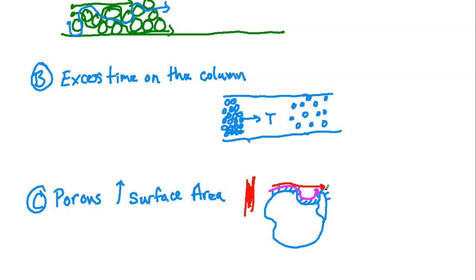Okay, and so this is the general concept of mass transfer, as we're jumping particle to particle, or we're literally taking the mass, the analytes, and moving them along the column. How long are they spending and how often are they transferring back and forth between the particles? Well, that can be a factor here. We need to consider the fact that most of these particles, the stationary phase particles, are porous, and so the analytes may have a different amount of time that they're spending in each of these various pores, okay?